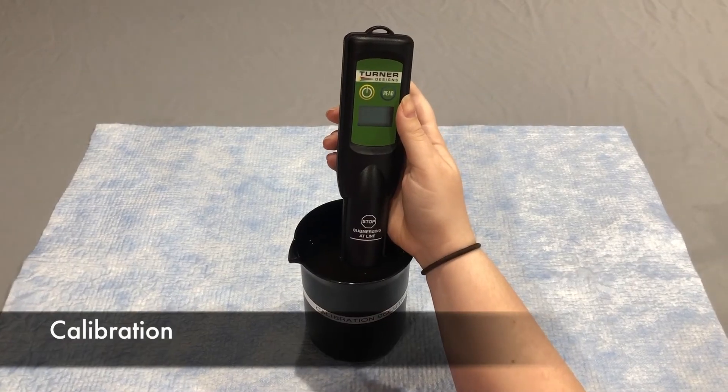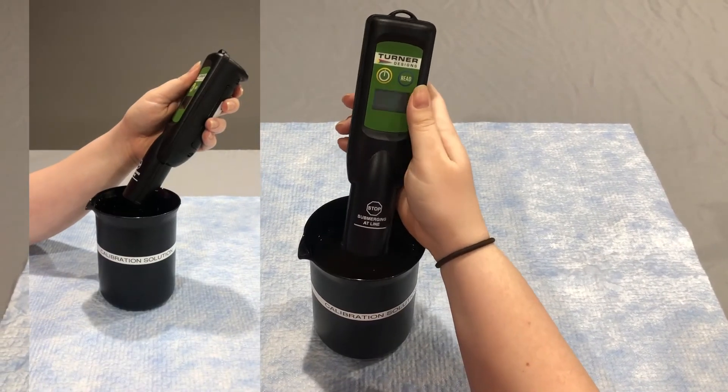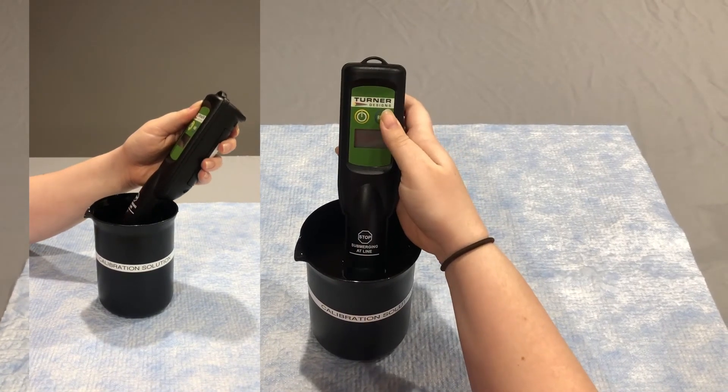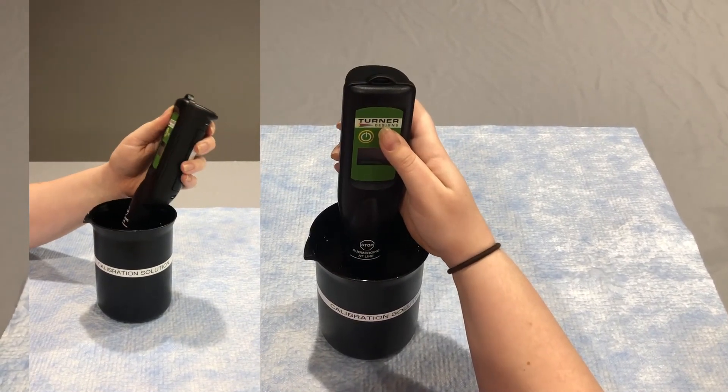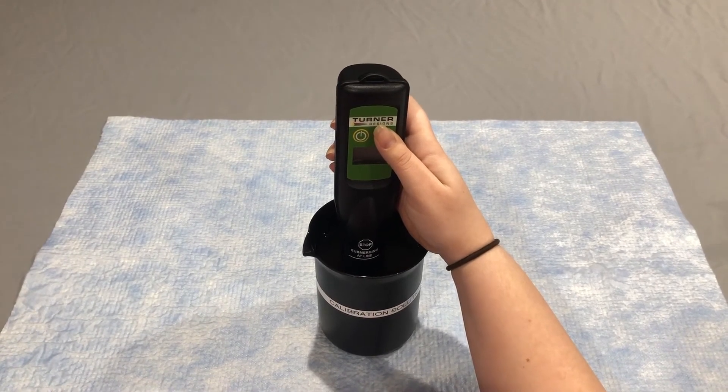Place the optical head of the Fluorosense into the calibration solution. To avoid bubbles, start by inserting it at an angle and then straightening it. Keep the optical head submerged about one centimeter and make sure that it's in the center of the beaker.